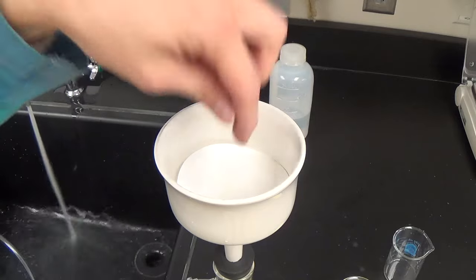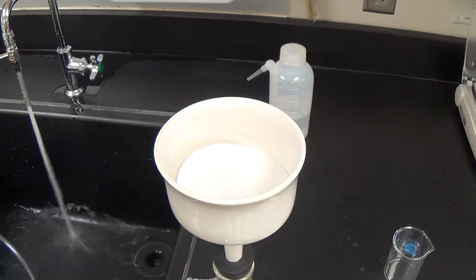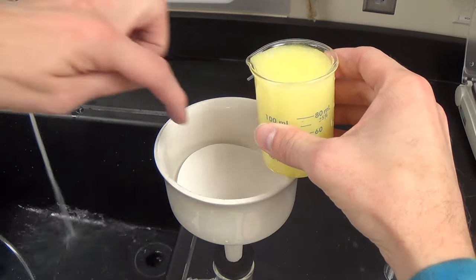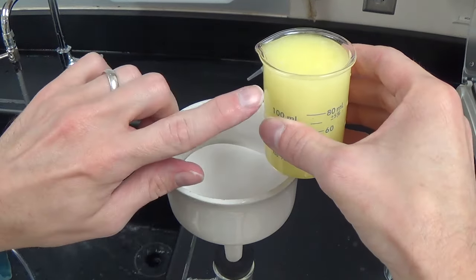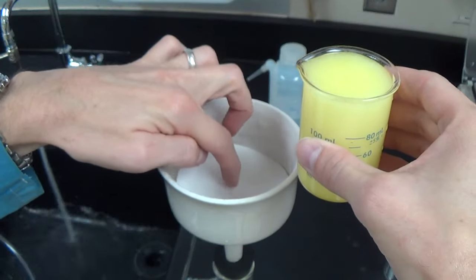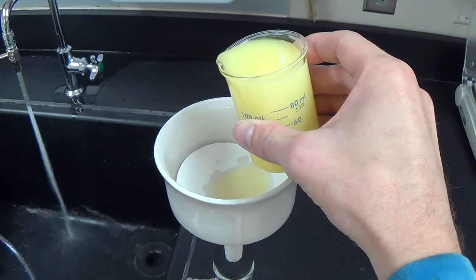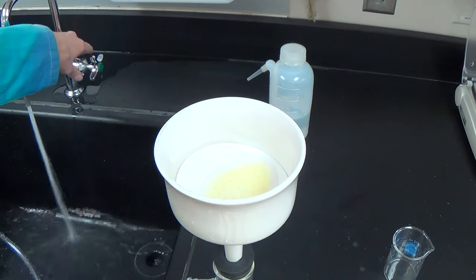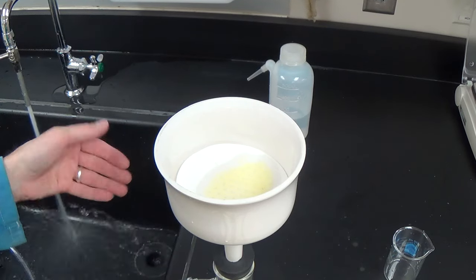I can actually hear the vacuum from here. You may not be able to, but that's okay. Now I'm still going to slowly and carefully pour my liquid into the filter paper, into the funnel, and through. I'm going to do this in a way that only gets it as close to the center as possible. You do not want it reaching the ends of the filter paper itself. That might cause the liquid to wrap around the ends and then not get filtered.